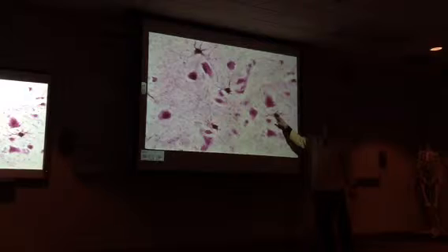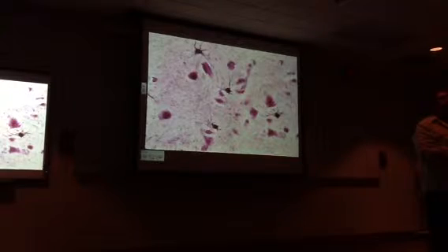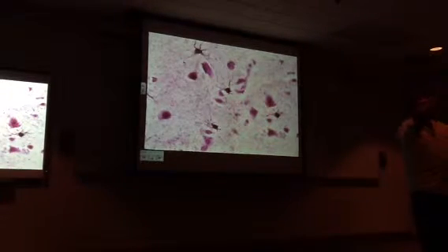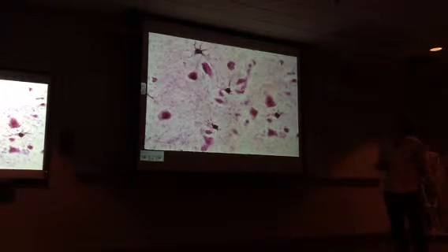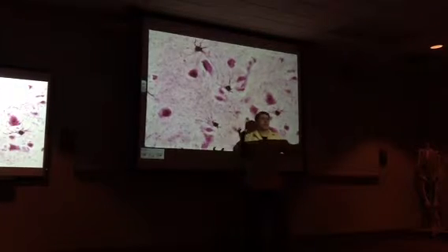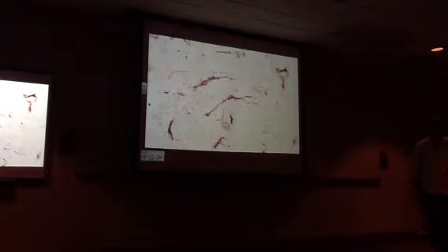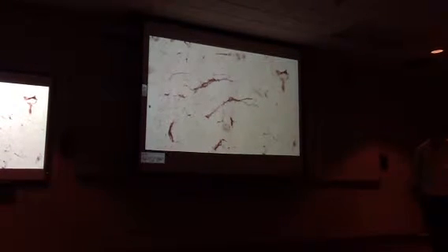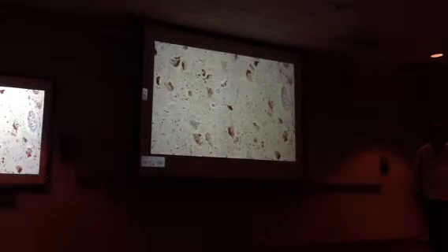oligodendrocytes, which in the central nervous system play the same role as Schwann cells. They invest the axons with myelin. And one oligodendrocyte is thought to invest multiple axons, which is why it looks like it has these little things coming off and projecting, maybe almost imagining that they're wrapping around some of the other neurons. And again, you'd never be able to recognize this just that way, but these cells are microglial cells, which are macrophages in the central nervous system.